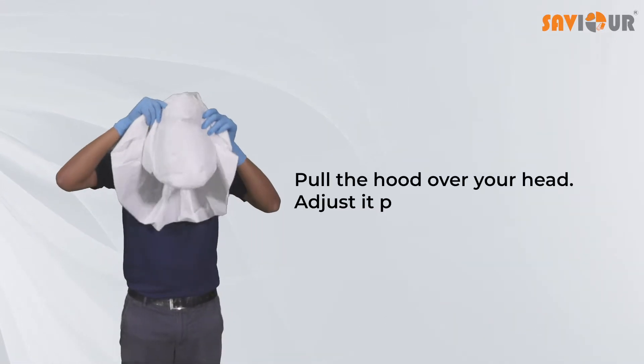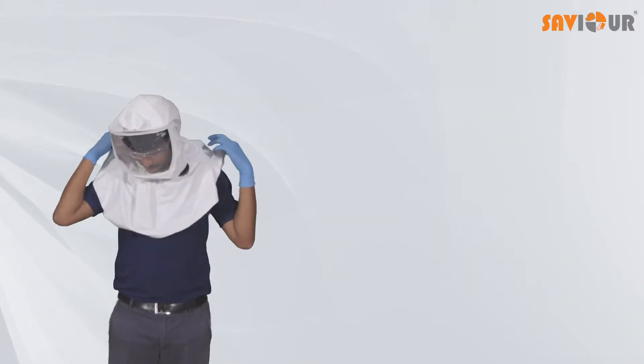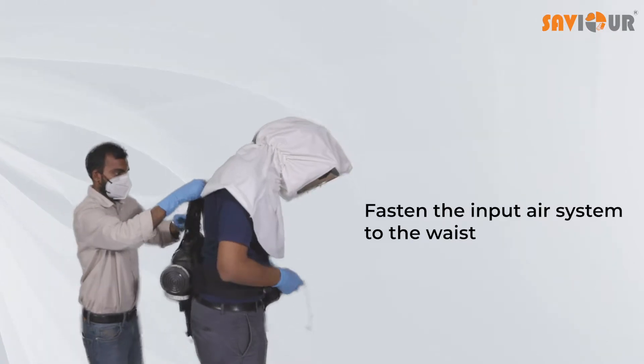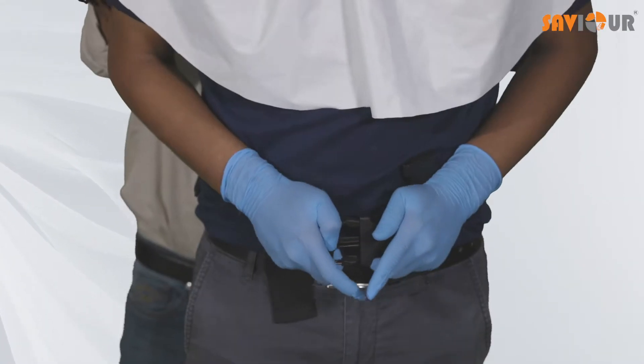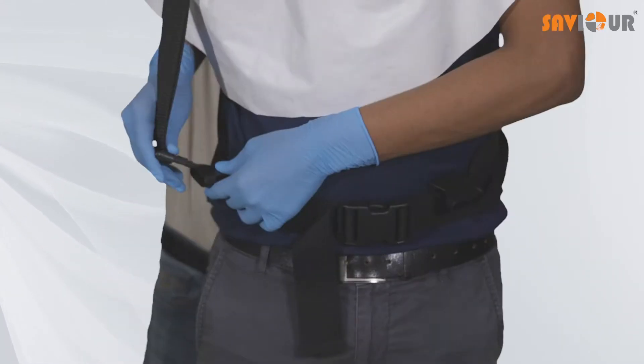Pull the hood over your head and adjust it properly. Fasten the input air system to the waist using the belt, and ensure the system is in place with the upper suspenders.